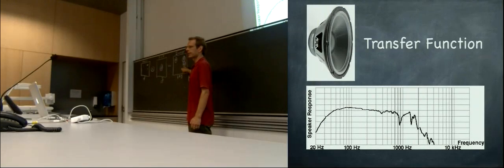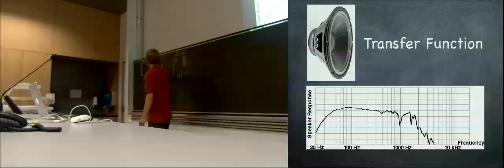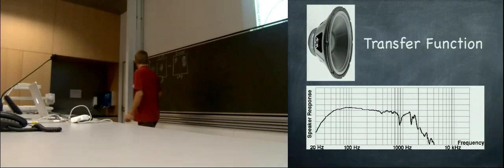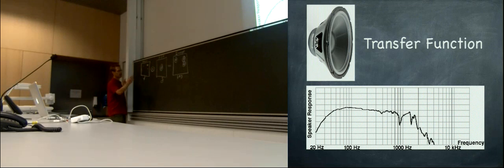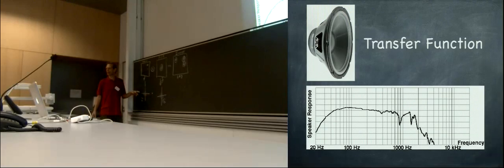But then you have this, and now the question is, what is this? Is this how my structure looks like? Or is it actually still the point spread function in there? And I need to get rid of that. And yesterday, when we spoke about the Fourier transform, we said we can Fourier transform this into a Fourier transformation capital F that has whatever structure it has. And this is multiplied with the Fourier transformation of this, capital G, and it's only one multiplication, which is computationally much faster than the convolution.